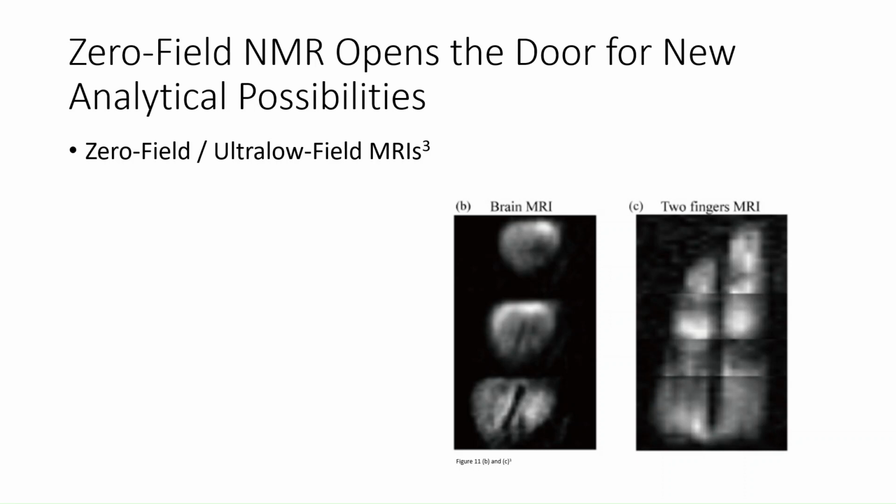One difficulty of using zero field for MRIs is that the image quality improves with magnetic strength, so using zero field would result in bad imaging. Today, it is more likely to create MRI instruments that are technically ultra-low field NMR and not truly zero field, though research and experiments are ongoing.